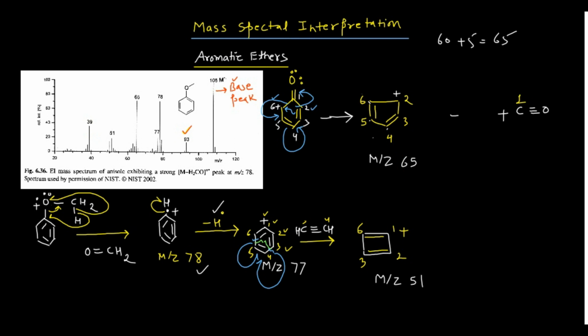So straightforward, what can you do? 65 minus 39, that means here 6, and then here 2, 26. So how can I get the 26? Simply your acetylene. 12 plus 1, 12 plus 1, all will make 26. So I need to remove this. So now again I will remove the acetylene from this part. So how can I remove the acetylene from this system?